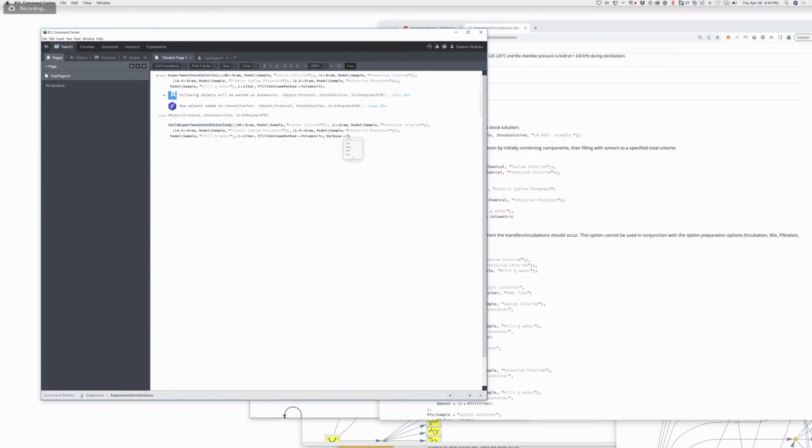Is it still verbose? Did I have the right? I think it's verbose. Okay, what this is going to do is show you all those ugly back-end checks we do to make sure you're not going to burn our lab down. So here it's going to go through and check all the composition stuff. That stuff is available. That the precision is okay for what you gave it for the stuff that has to be measured out.